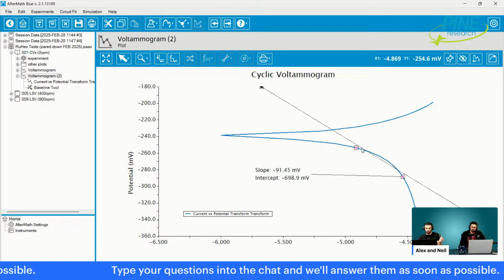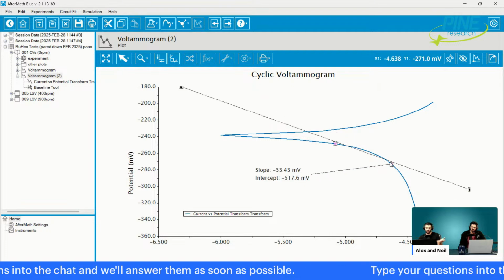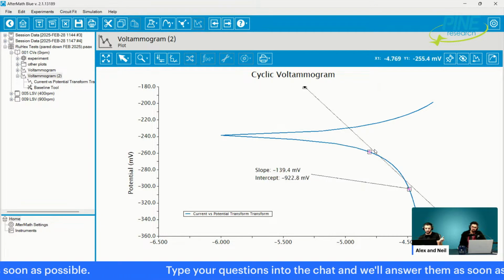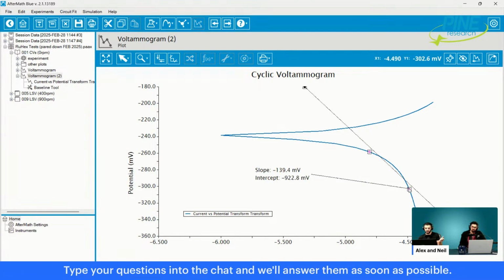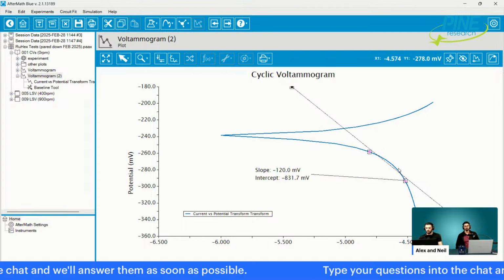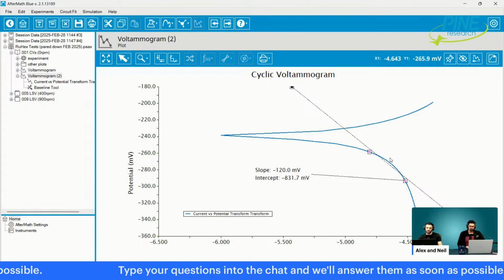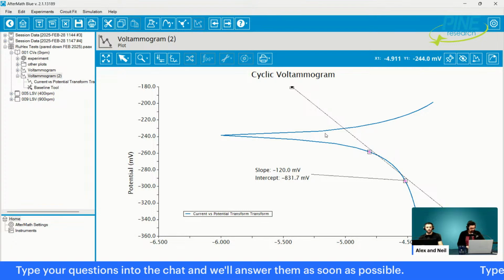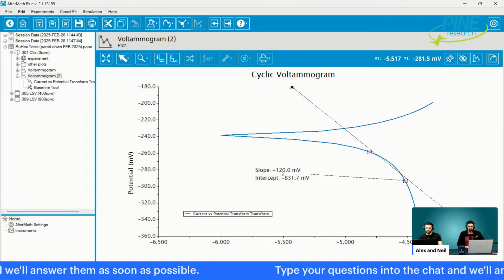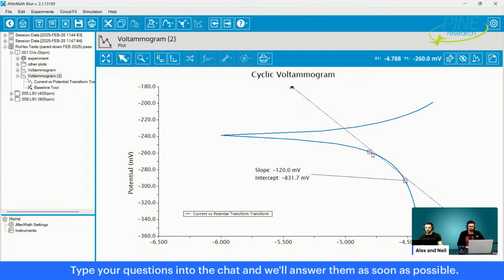So the question is more, where do I take the Tafel slope, which is a question I do get a good amount as well. The typical number is 120 millivolts per decade, right? That's the number that is indicative of an alpha value of 0.5, perfect symmetry, as well as one electron transfer. And so sometimes what you're doing is exactly what I just did here, which actually happens to be exactly 120. It's perfect here if I set these limits. So I could say, well, these are the limits.